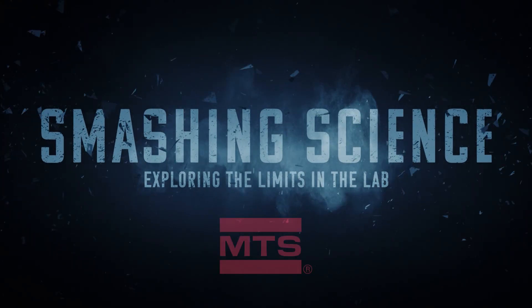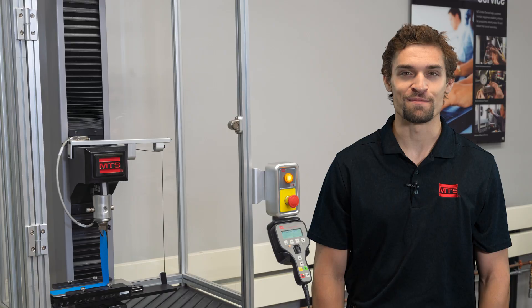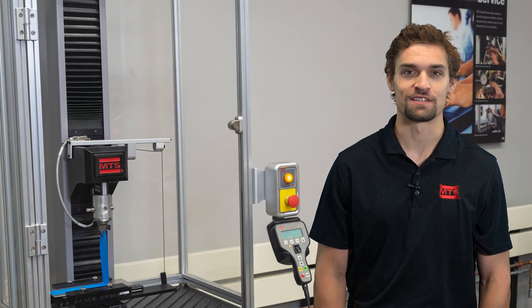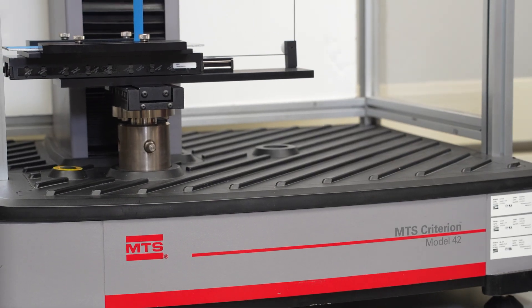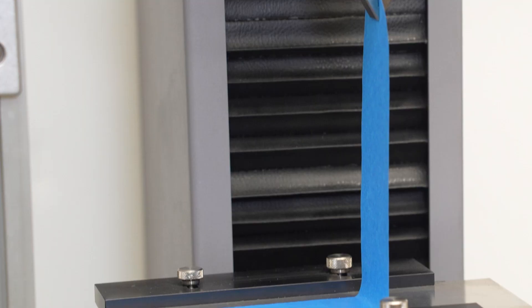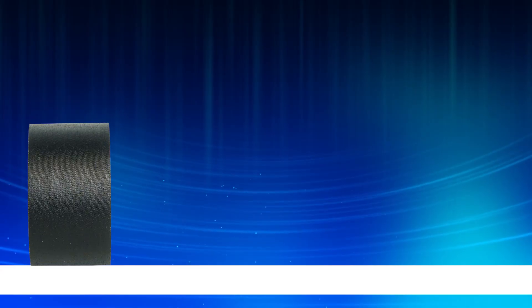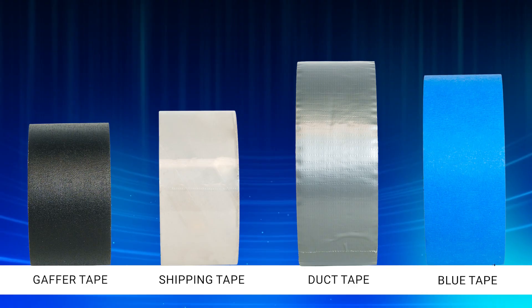Smashing Science — exploring the limits in the lab. Hey, I'm Dane, and on this episode of Smashing Science, we wanted to appeal to your tape needs. Using an MTS Criterion testing system, we wanted to do a 90-degree peel test on different types of tape to determine which one has the best adhesion. Let's find out.